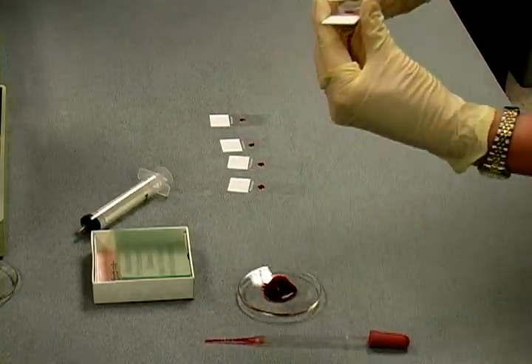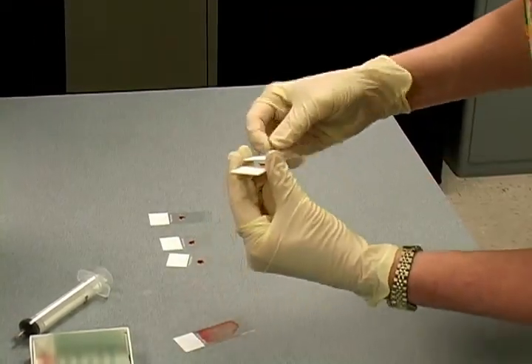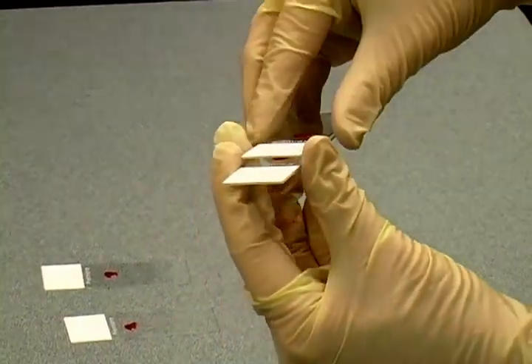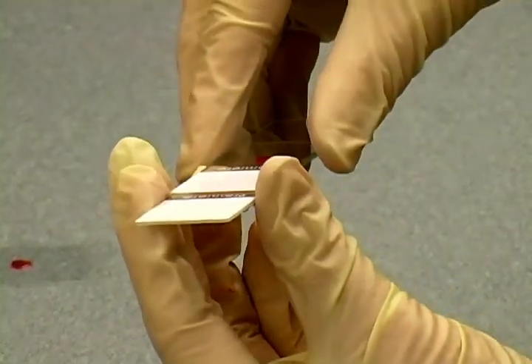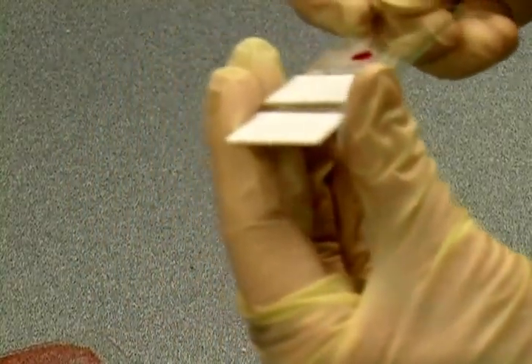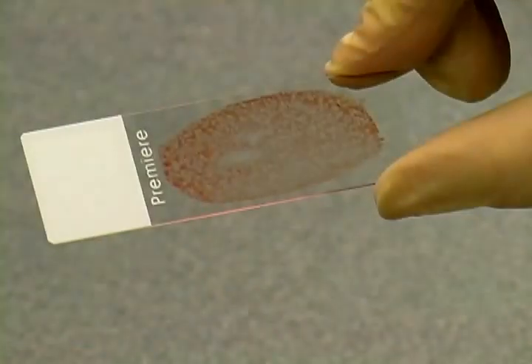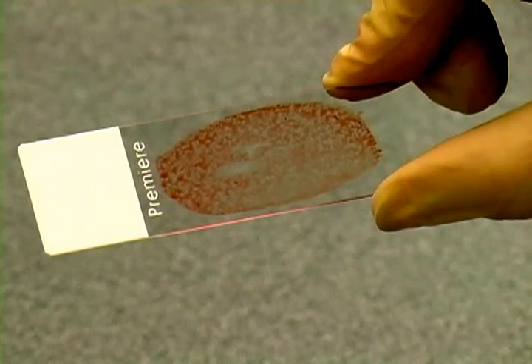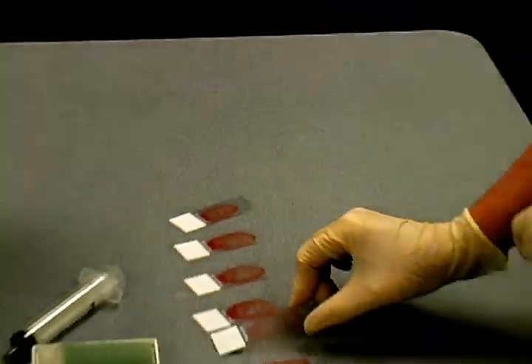The marrow droplet is spread by applying the top back of the adjacent slide gently over the drop. In a smooth continuous movement, the top slide is pulled across the lower slide, evenly spreading the marrow. The result is an oval of evenly spread marrow aspirate over the center of the slide. These slides are then allowed to air dry completely and sent to ProPath.